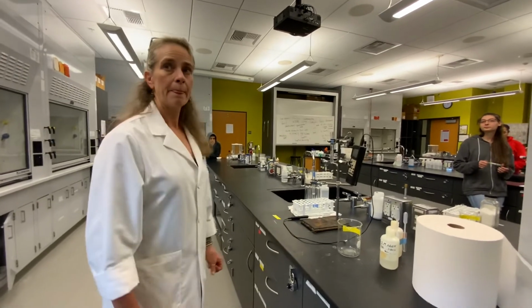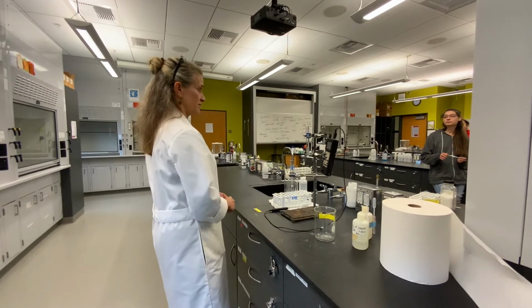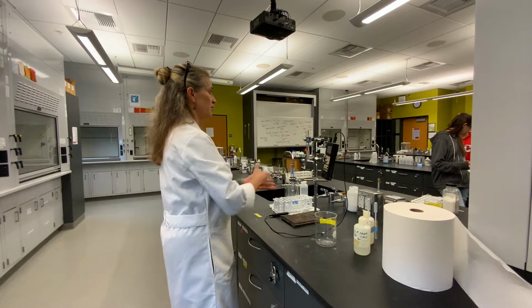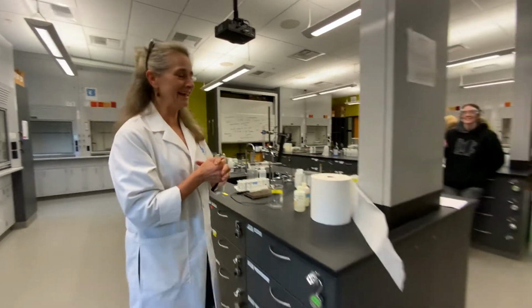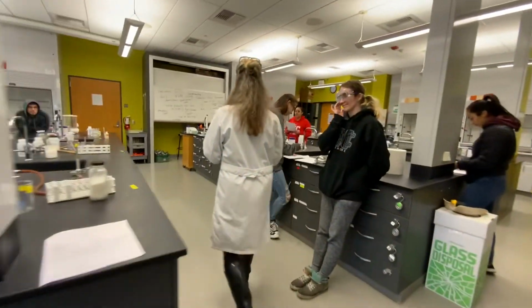Jen, we are going to combine those, aren't we? Yes, I'm sorry. Yes, you're pouring them together and then taking the temperature. So you're taking the initial temperature and then you pour them together and take the final temperature. That's what you're observing. So that's the reaction. Okay, thank you. Okay, so over here, we're going to talk about part 2.